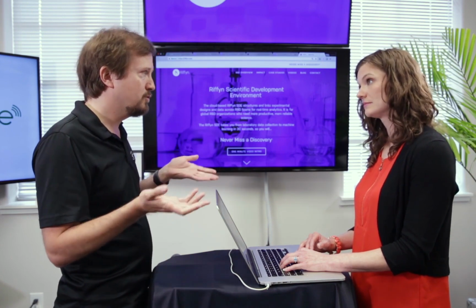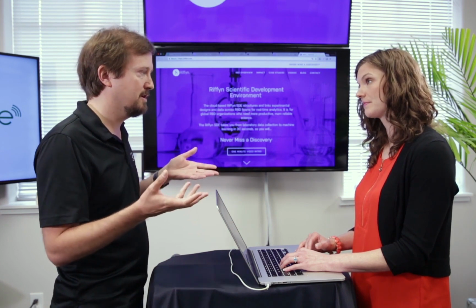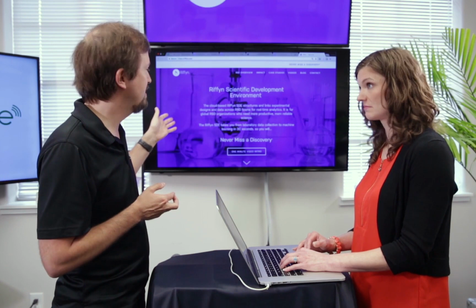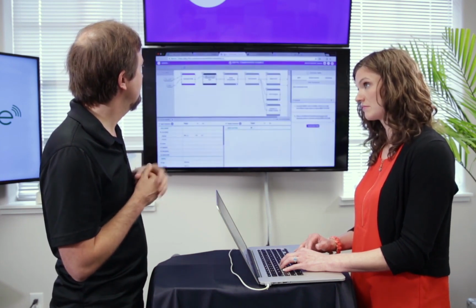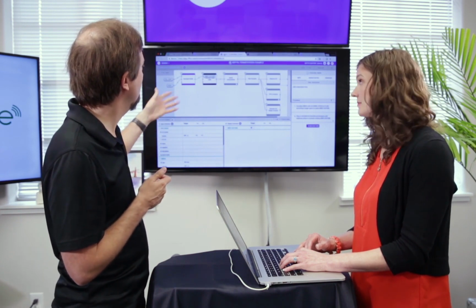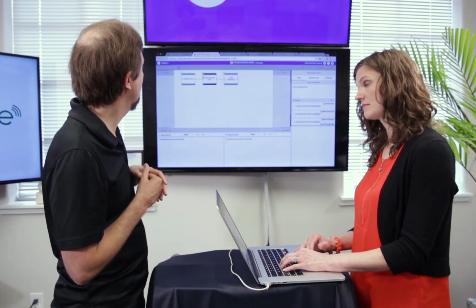So talk us through a workflow that a company might use for the production of succinate. And maybe you can just pull up Riffyn and just show us how you start off. Maybe grab something and throw it into this framework that you're seeing. So if I wanted to start from scratch and just pull something up and throw in something, how would I do that?